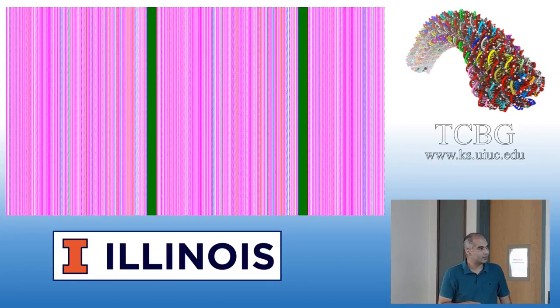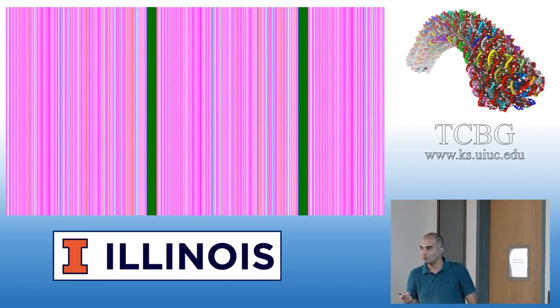The way I would do it, I would first make most of the things in 2.0. Then you save the JSON file. Then you can go to 2.5 and just make that change. Let's say if you want to do scaffold, like a hairpin or something, for those kinds of specific parts. And after that, you can feed it into the simulation program.